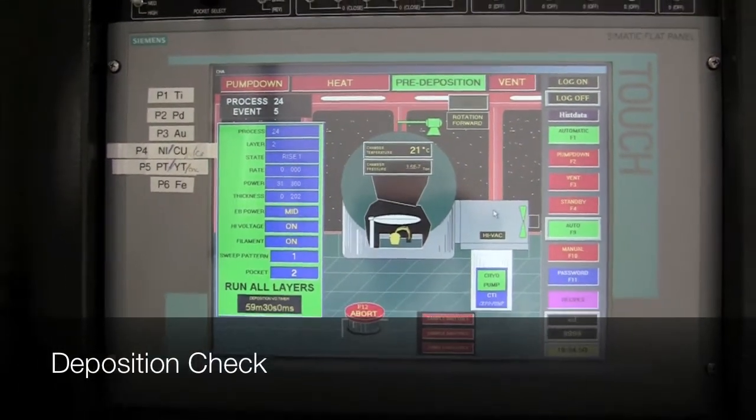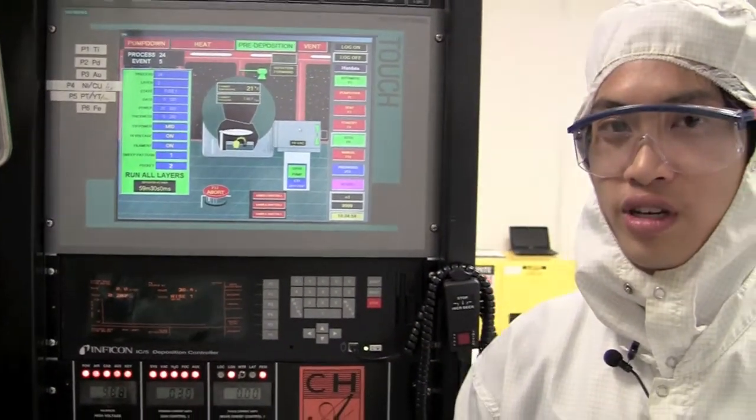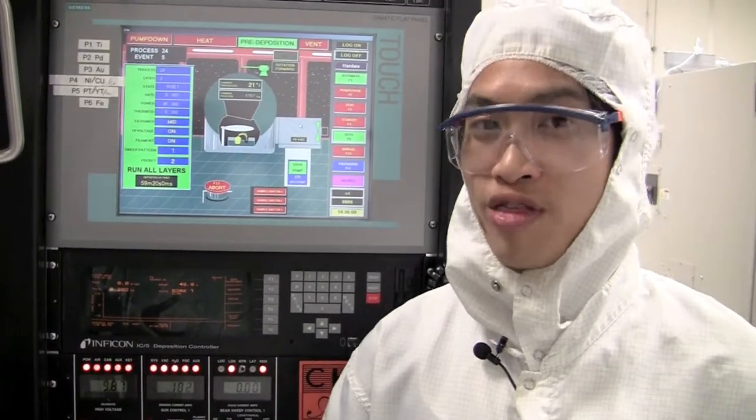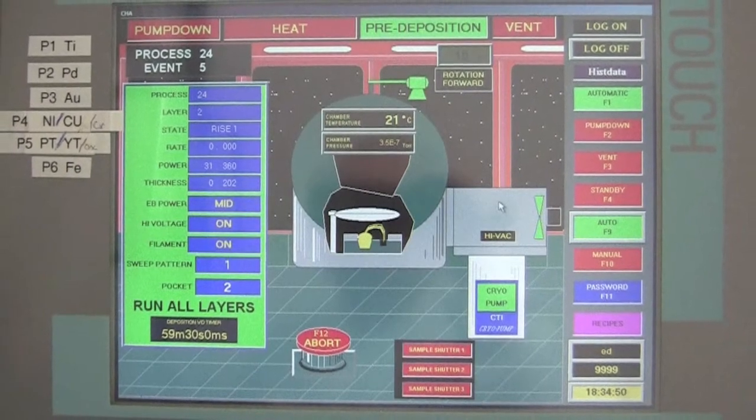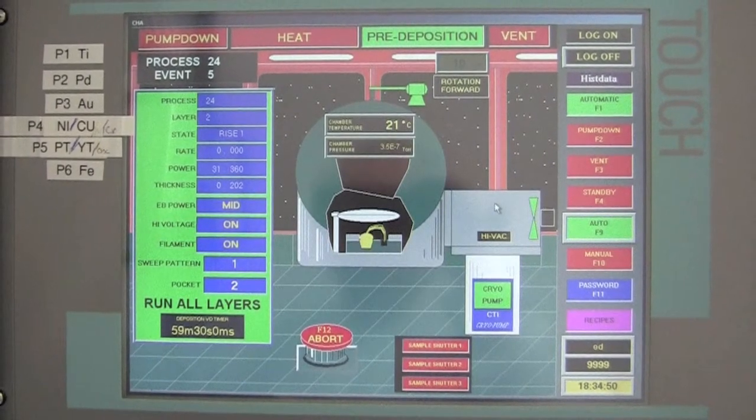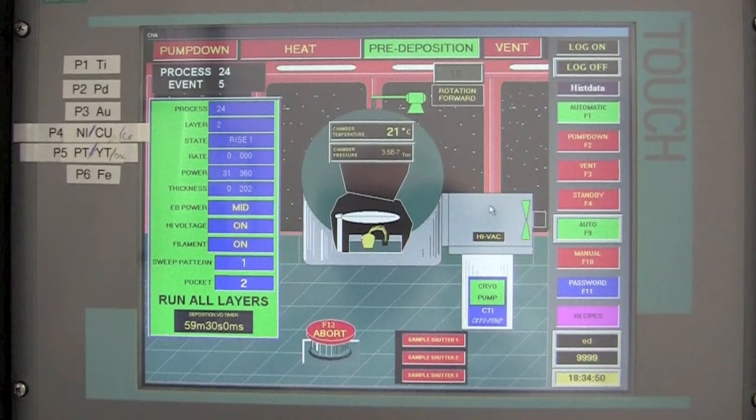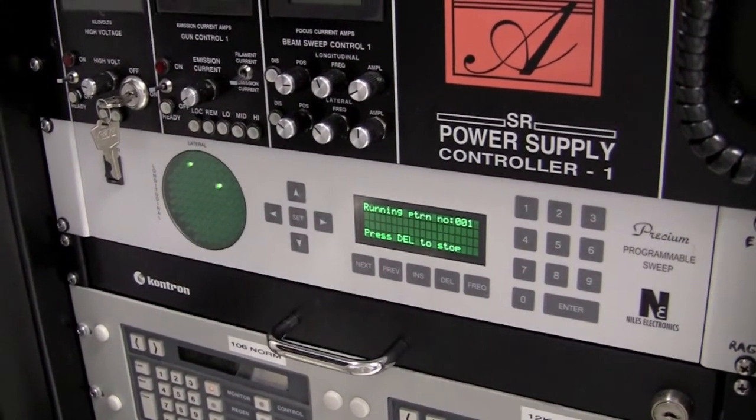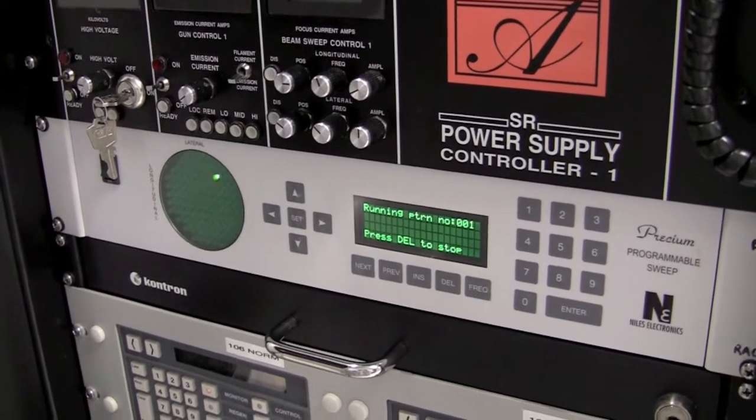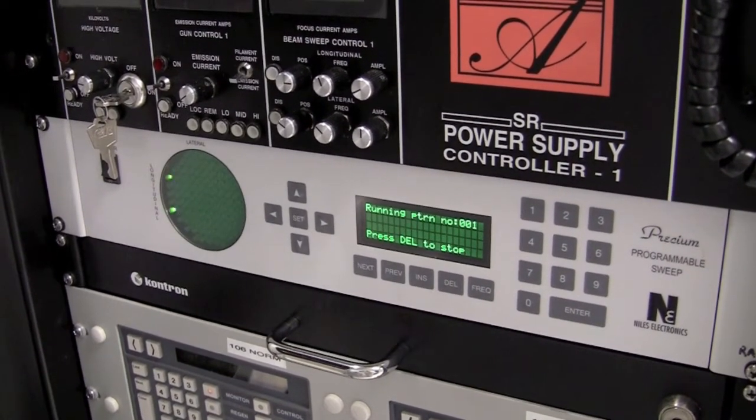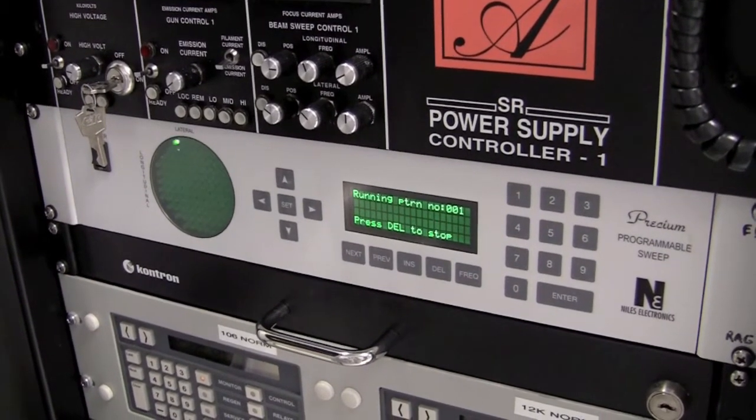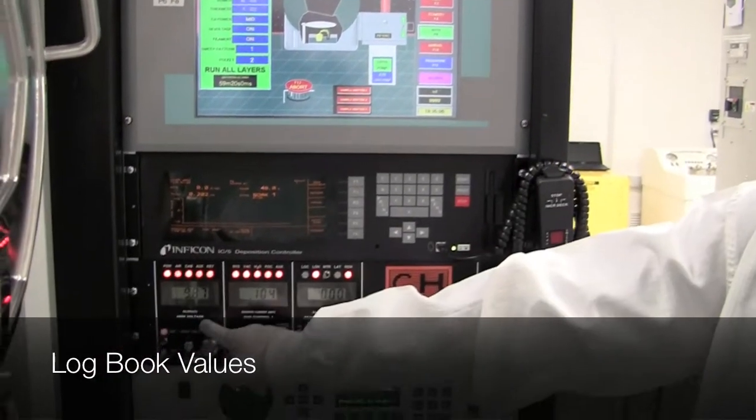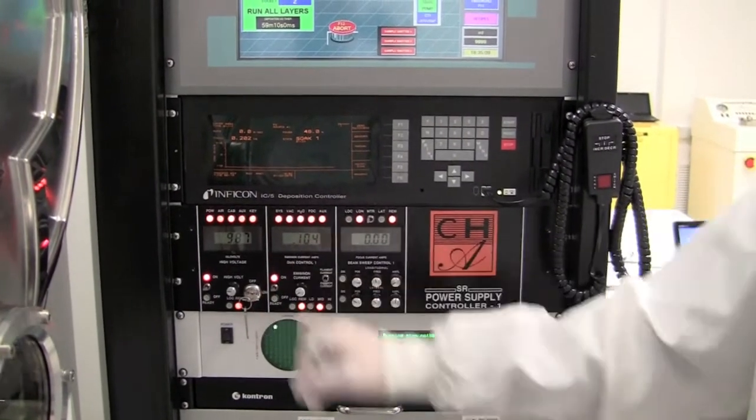Deposition should be fully automatic, but the user should verify that everything's running smoothly, including turret rotation, shutter opening and closing, and most importantly, metal thickness. We also want to verify that the wafer planetary is rotating, which is indicated on the GUI by a green cartoon next to the rotation forward message. We also want to check the sweep control panel to verify that the E-beam is sweeping in pattern 1. We should also check that the sweep is hitting the crucible by looking through the glass window on the door. In the logbook, you're going to want to record the values of the voltage and the current at the instant the shutter opens.